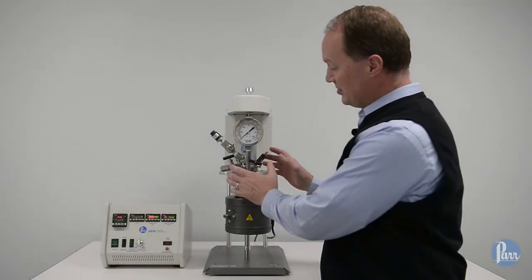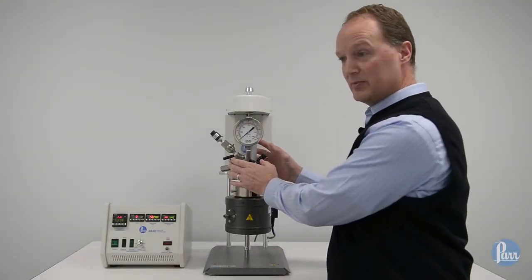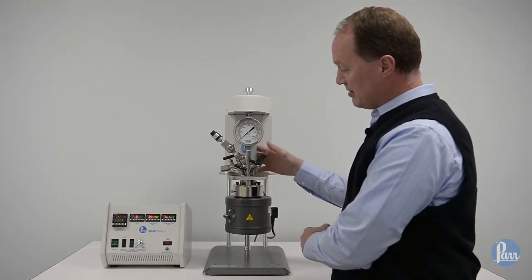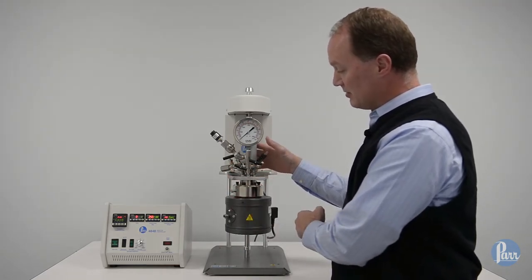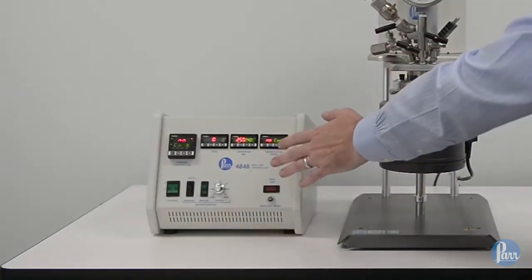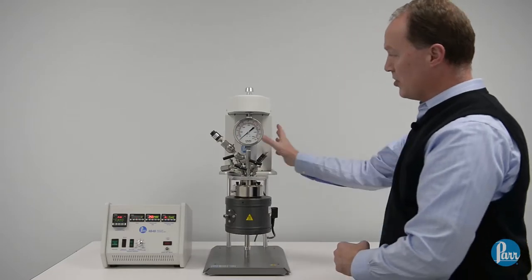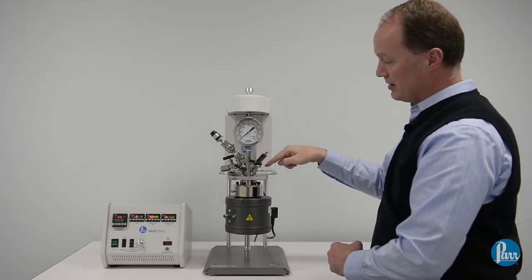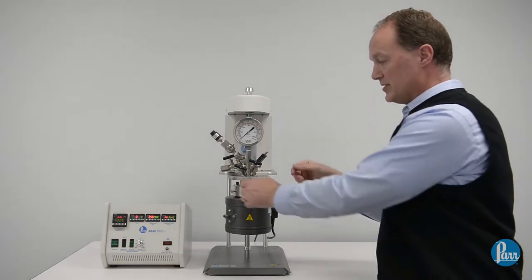Today we're going to talk about the main features of the Parr mini reactor vessel assembly, which consists of head closure, cylinder, and main head fittings, along with some internal pieces. To give you context of the full system, you can see the controller, the stand, the motor in this enclosure, as well as the overarm drive which drives the magnetic drive.